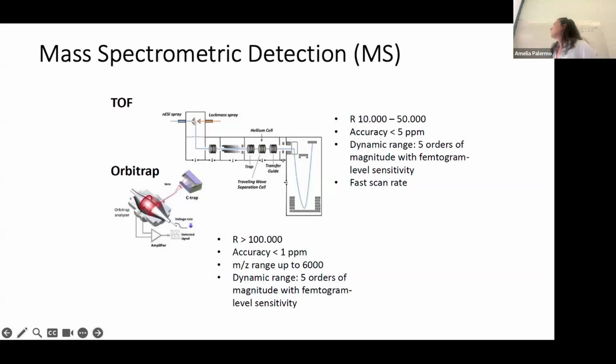It's usually a better instrument for proteomics for many reasons. One being definitely the accuracy, but also the resolution that it provides in the shape of the peaks in proteins and in peptides from proteins. But the peaks in proteomics are per se more complex and closer because of multi-charges. So that's a different discussion to some extent.